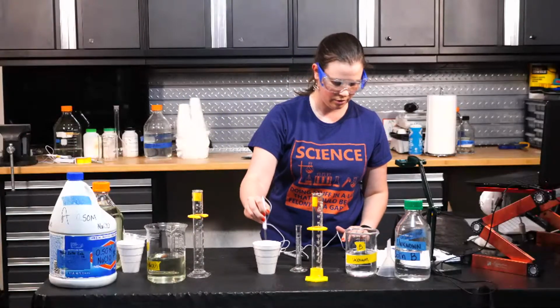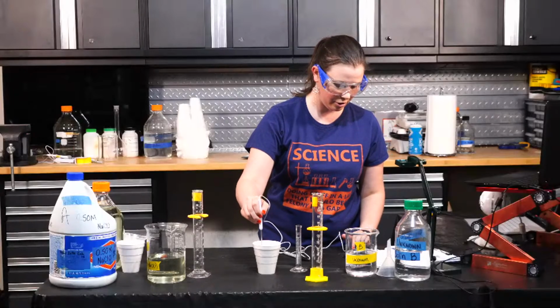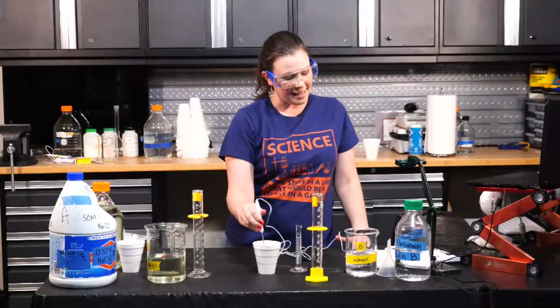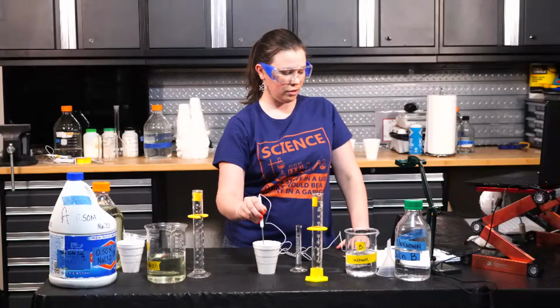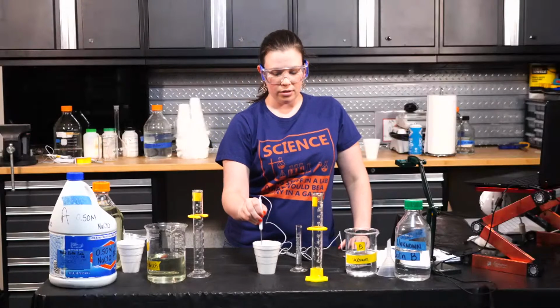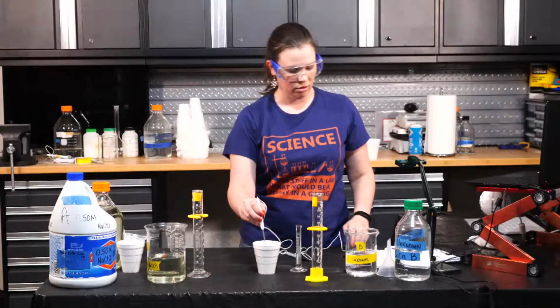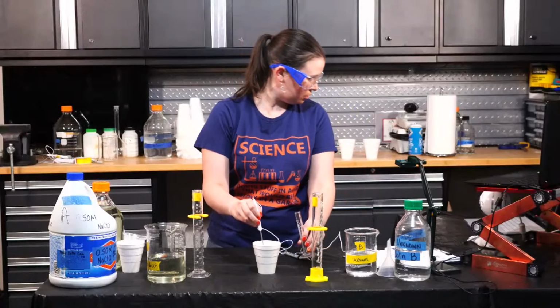All right. Unfortunately, it's getting a little bit colder in here. My baseline temperature for level 5 is 18.9 degrees Celsius. So we dropped a tenth of a degree. 18.9 degrees Celsius to start. All right, ready to add our 5 milliliters.